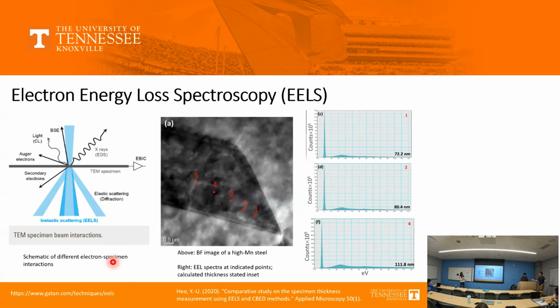So this is basically counts on the vertical axis by electron energy on the horizontal axis. There's some difference between your incident beam that is hitting the sample and what passes through and what's recorded by this. I won't get totally into it, EELS is very complex. You can break that signal into a lot of different information. Some of it is electronic structure and that sort of thing. You can get some compositional information, although I think EDX is generally more used for that just because it's easier.